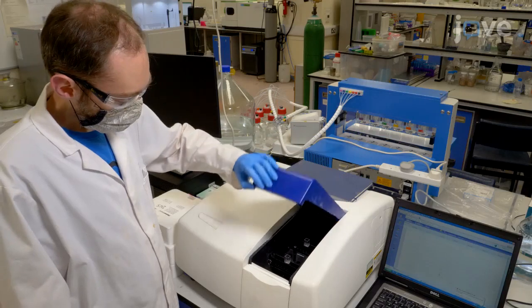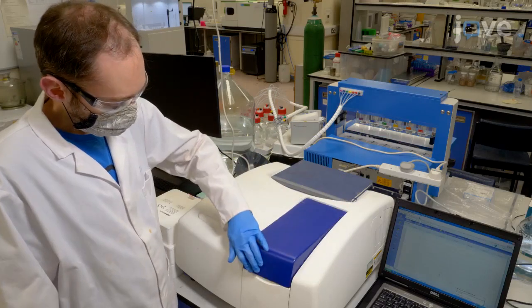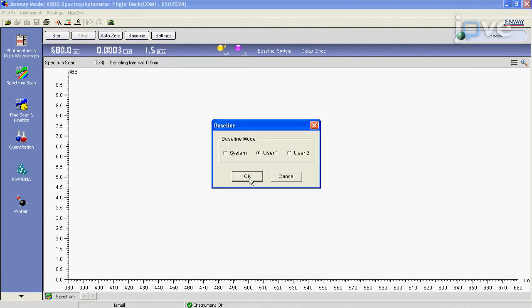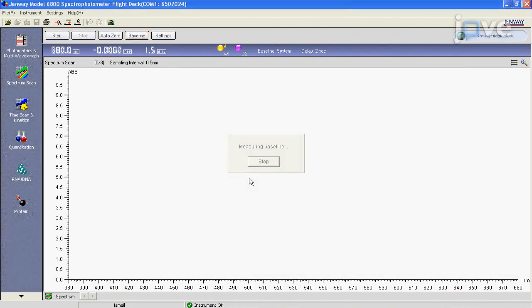Close the instrument cover and continue with blank calibration by selecting blank from the command bar, then select OK.